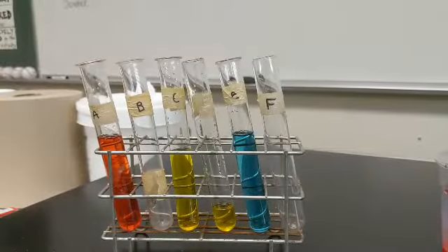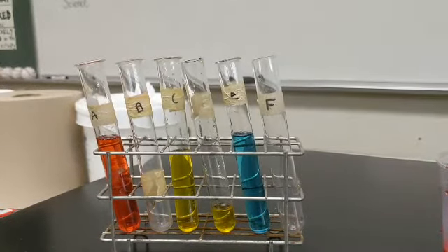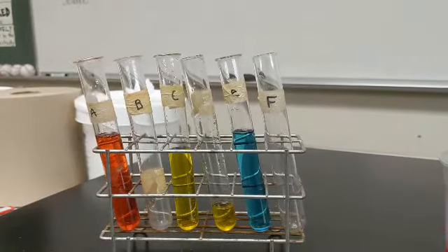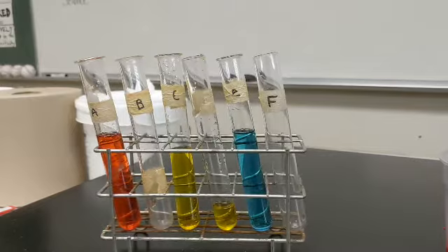Okay, step 5 says, from test tube E, take 7 milliliters and add it to test tube D, and then mix with the pipette. So 7 milliliters from test tube E, pour it into D.